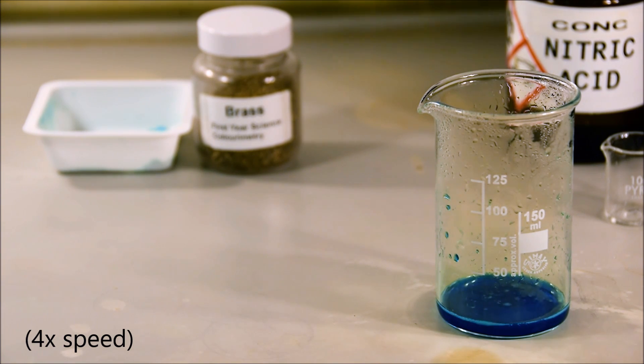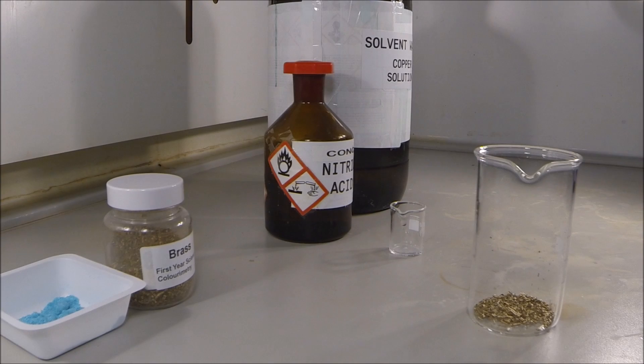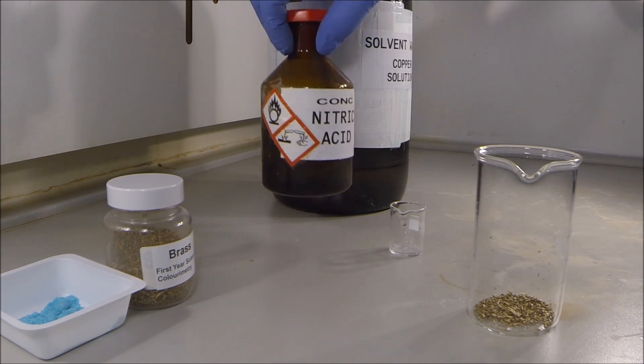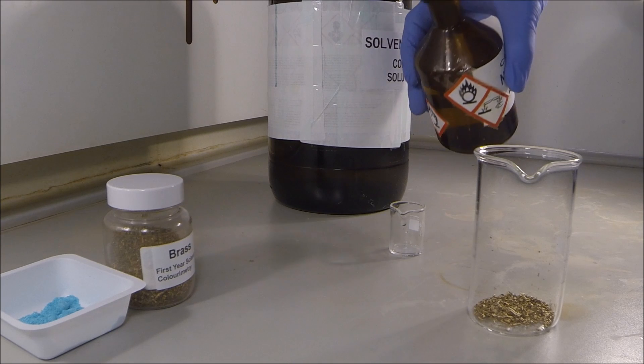So let's have a quick look at how we've set this up. The first thing we did was we massed out exactly, approximately 2 grams of brass shavings. That is, we know precisely how much we've massed out. We then put that into the fume hood and we measure out approximately 10 milliliters of nitric acid. It's very important we know exactly how much brass, not so important we know how much nitric acid, since the amount of nitric acid, as long as there's an excess, isn't going to affect the amount of copper that we have in solution.